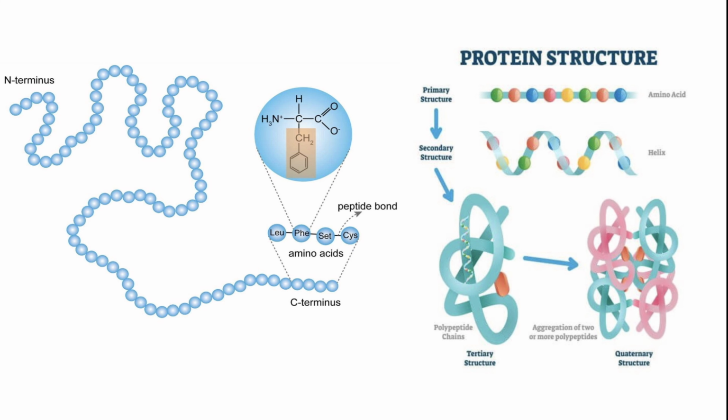Copper sulfate present in the Biuret reagent will react with the peptide bonds present in the protein sample, and this will form the violet color. So this denotes the presence of proteins in the sample.